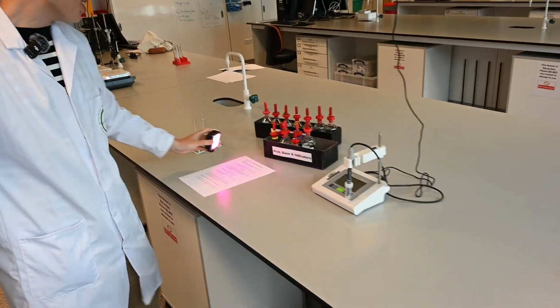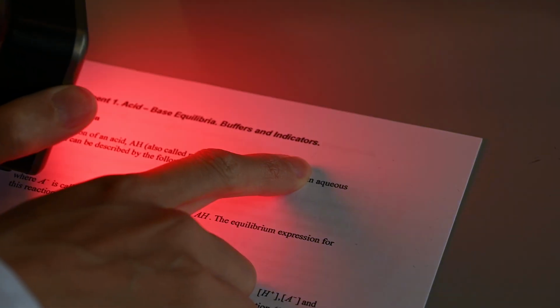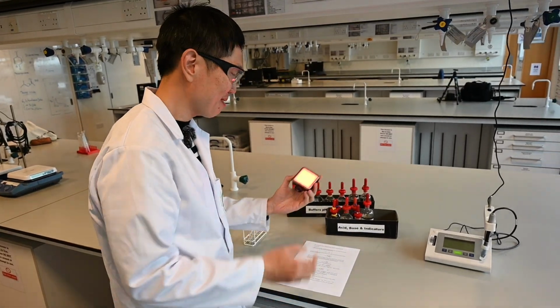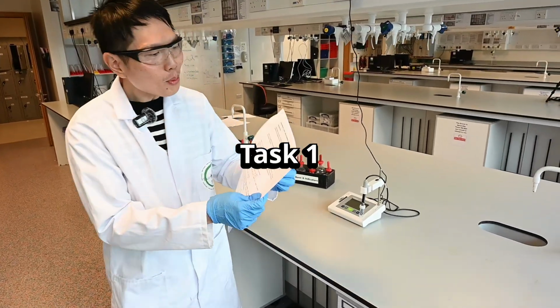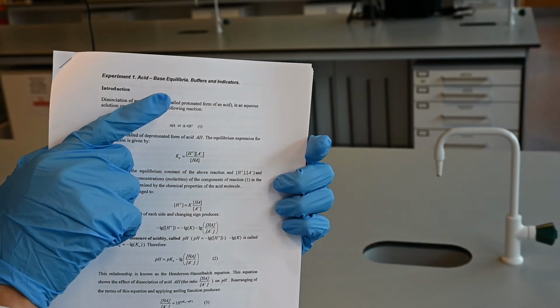So today we're doing, look here, Experiment 1: acid-base equilibria, buffers and indicators. Indicators are over here, right? There's not much color here, but under certain environments there are colors, and we can do it together today. So Experiment 1 is acid-base equilibria, buffers and indicators.